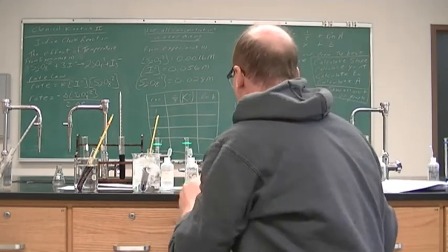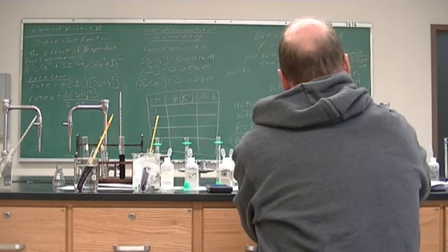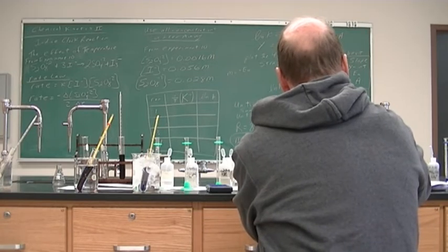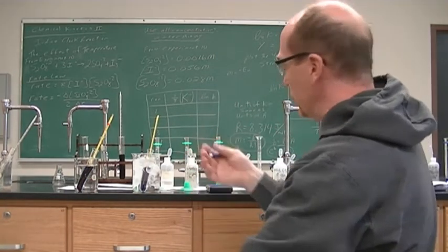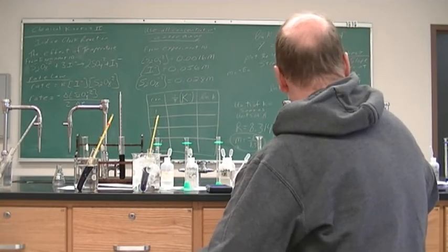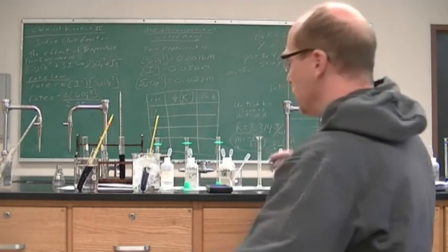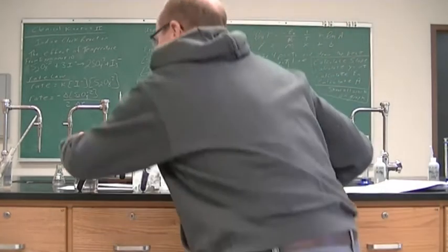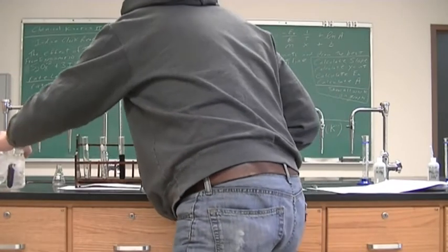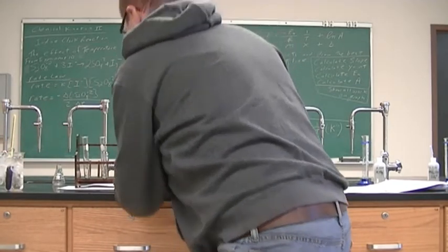Oh, and then we have 9 minutes for the ice water bath. So at 9 minutes, it was 9 minutes, 0 seconds. Alright, but we have to subtract the 5 minutes. That makes it a nice simple subtraction. And so we have 4 minutes for the 10.3 degree Celsius cold water bath.